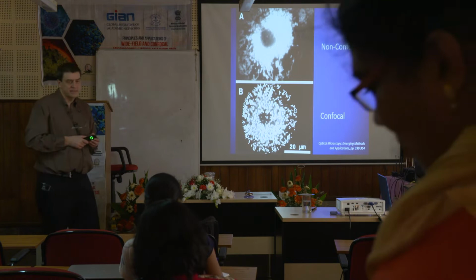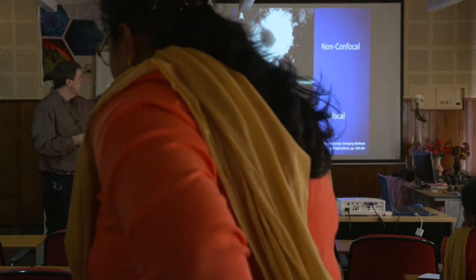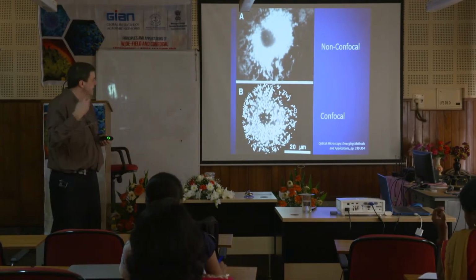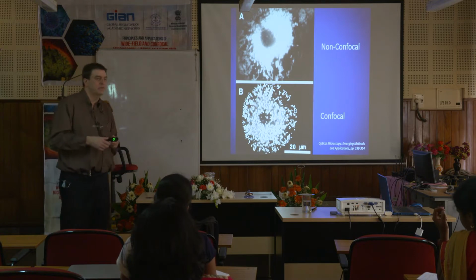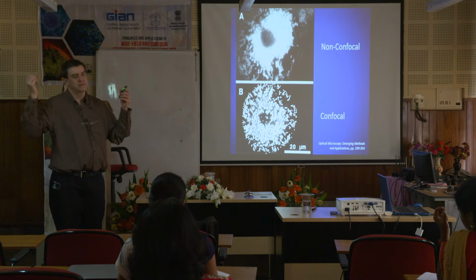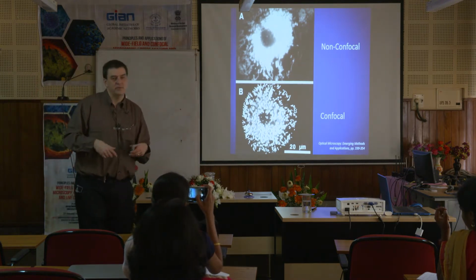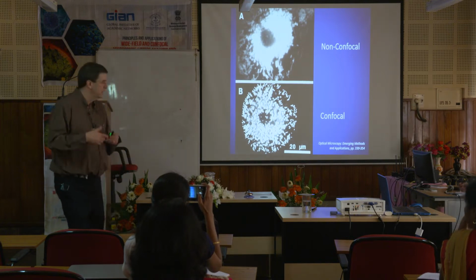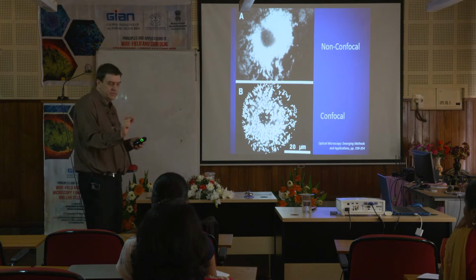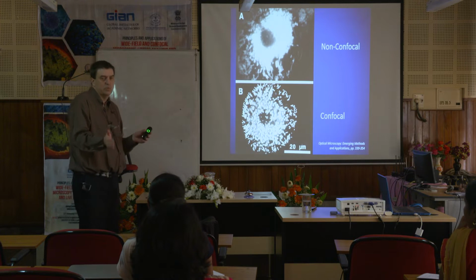So this is the classic confocal, non-confocal image. The top would be wide field, it's a cell, and the bottom would be a confocal image. So you definitely get that better resolution. And what have we been talking about since we started this course? Resolution, right? And what is everything? NA, because NA drives resolution, okay? NA drives resolution, and resolution is what it's all about. You have to be able to tell two parts apart from each other, two separate entities. You've got to be able to distinguish one from the other.